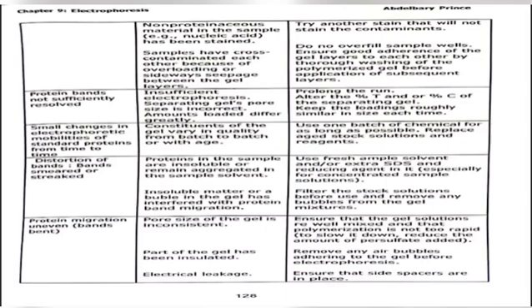Ensure good adherence of the gel layers to each other by thorough washing of the polymerized gel before application of subsequent layers. Problem: protein bands not sufficiently resolved. Cause: insufficient electrophoresis; the separating gel's pore size is incorrect; amounts loaded differ greatly. Remedy: prolong the run, alter the percent T and/or percent C of the separating gel. Keep the loading roughly similar in size each time.